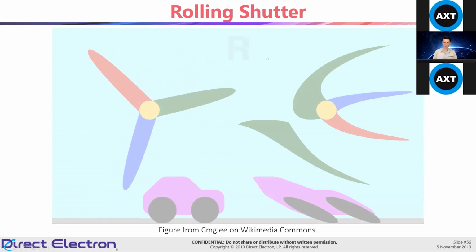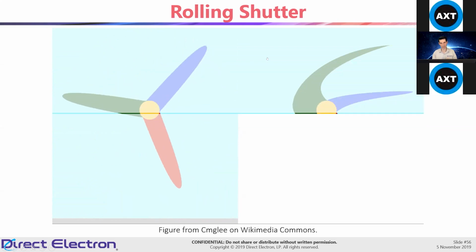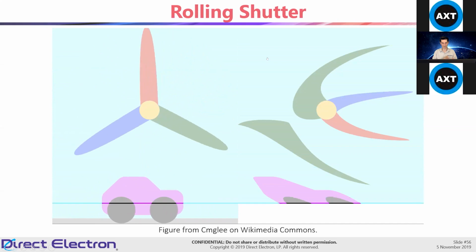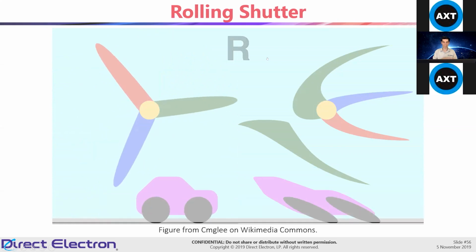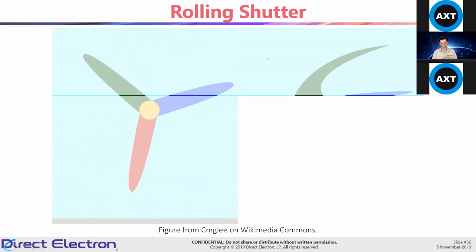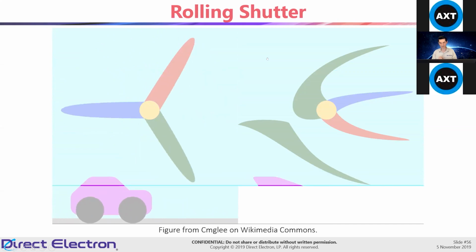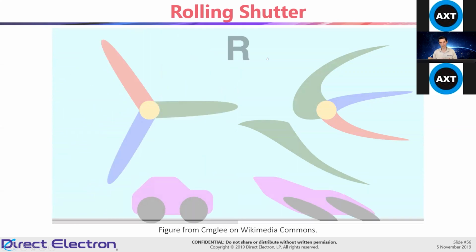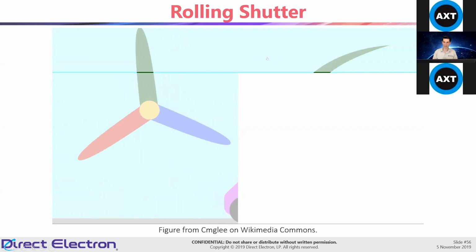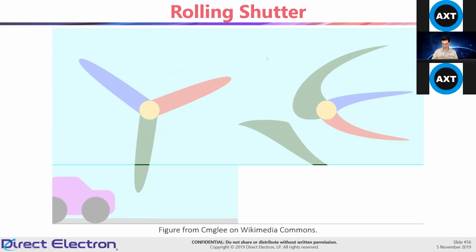But when you're talking about a diffraction pattern, that's where things become important, because the intensities for the diffraction spots, that's the information, right? That's what's really important. And so if you're getting a gradient from those spots from one frame to the next, then you're losing information, or you're contaminating the next frame with information from the previous area. And with a global shutter, you read out from all the pixels simultaneously. There isn't any delay.